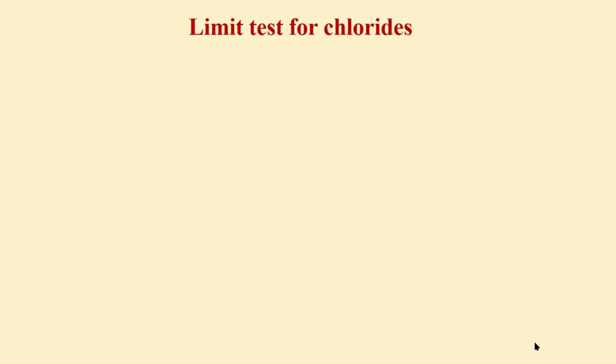Friends, very good morning. Today we are going to discuss the limit test for chlorides. This is a test which is used to know the amount of chlorides present in the given sample. Is it within the limits or not? How is it done? What's the principle behind it?